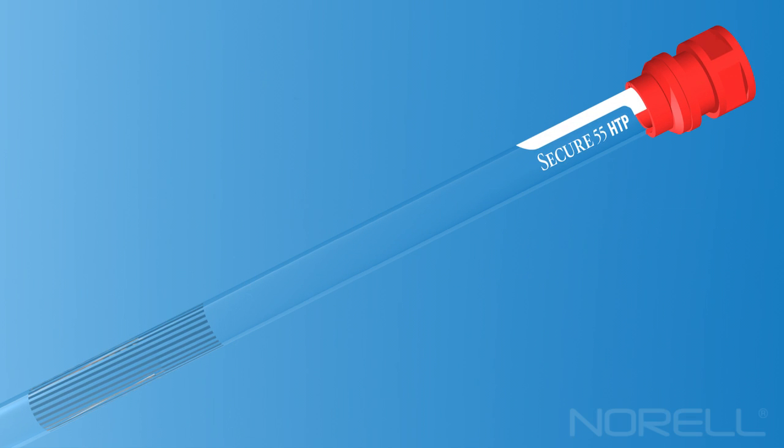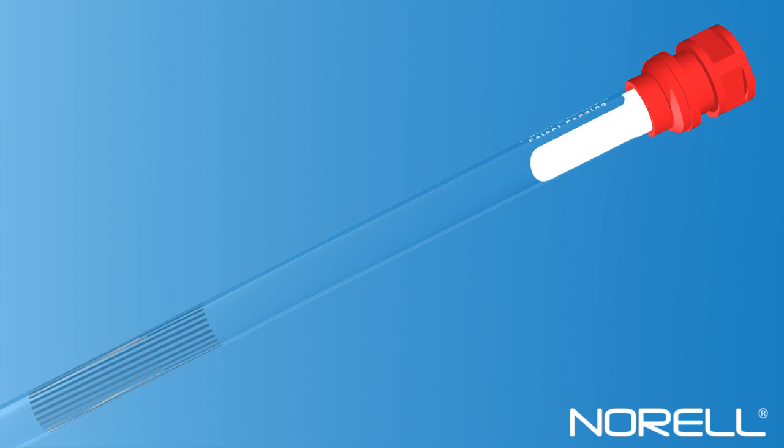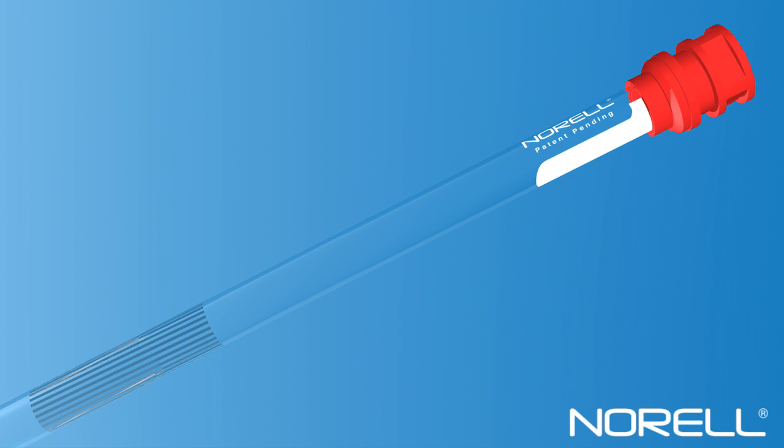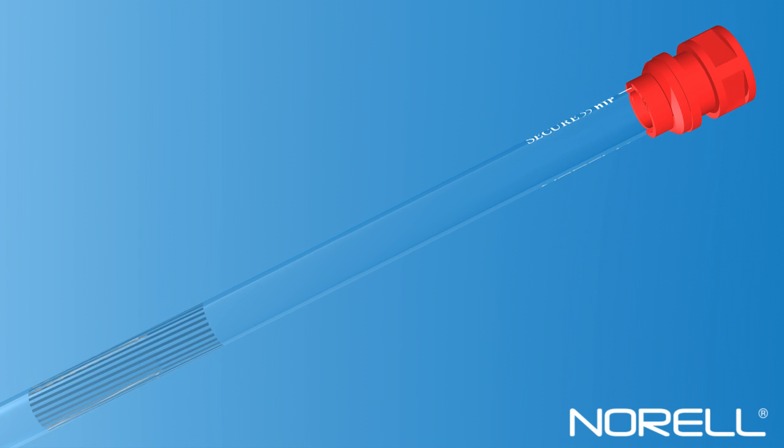The Secure Series NMR tubes feature several patent-pending design elements that add a superior level of sample containment and isolation, safeguarding the integrity of precious or critical NMR samples and assuring secure retention of the NMR tube in the spinner turbine.